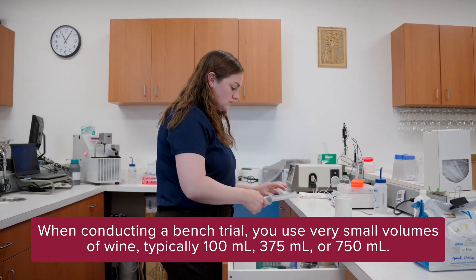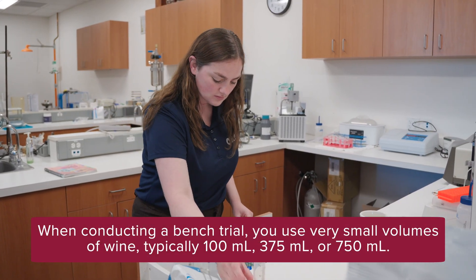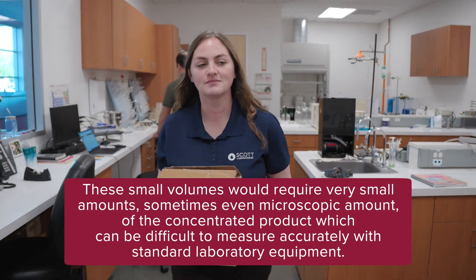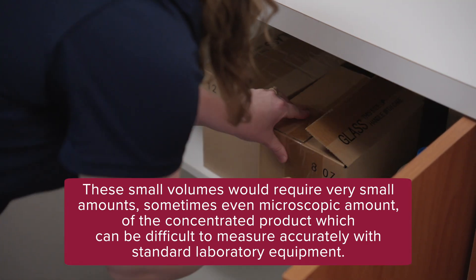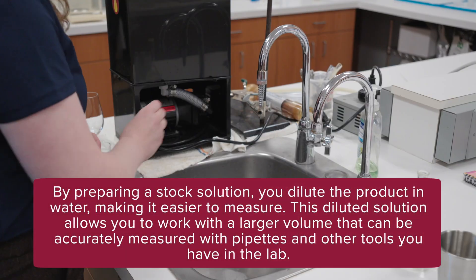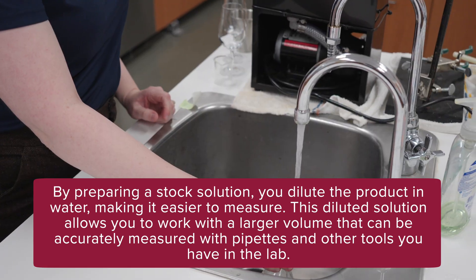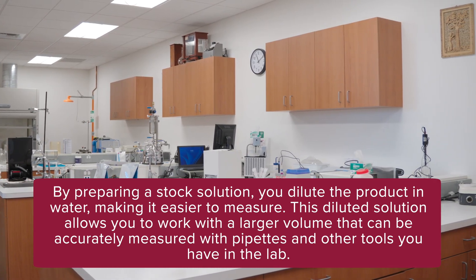When conducting a bench trial, you use very small volumes of wine — typically 100 milliliters, 375 milliliters, or 750 milliliters. These small volumes would require very small amounts, sometimes even microscopic amounts, of the concentrated product, which can be difficult to measure accurately with standard laboratory equipment. By preparing a stock solution, you dilute the product in water, making it easier to measure. This diluted solution allows you to work with a larger volume that can be accurately measured with pipettes and other tools you have in the lab.